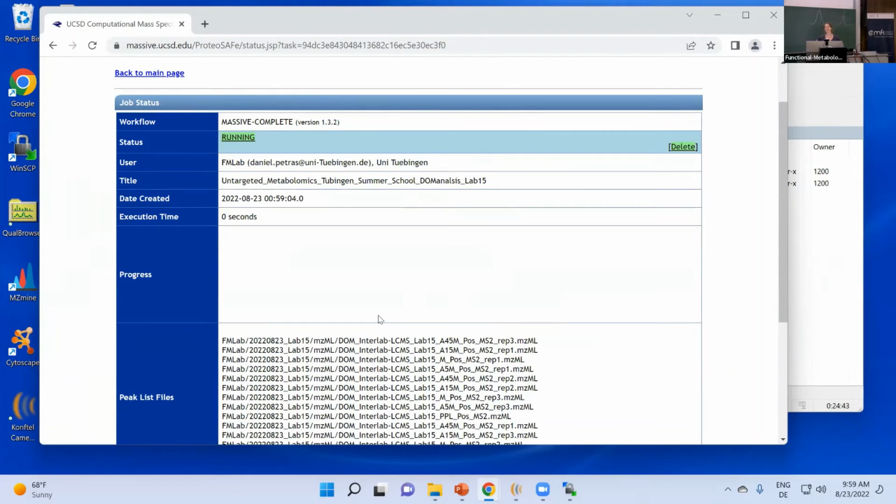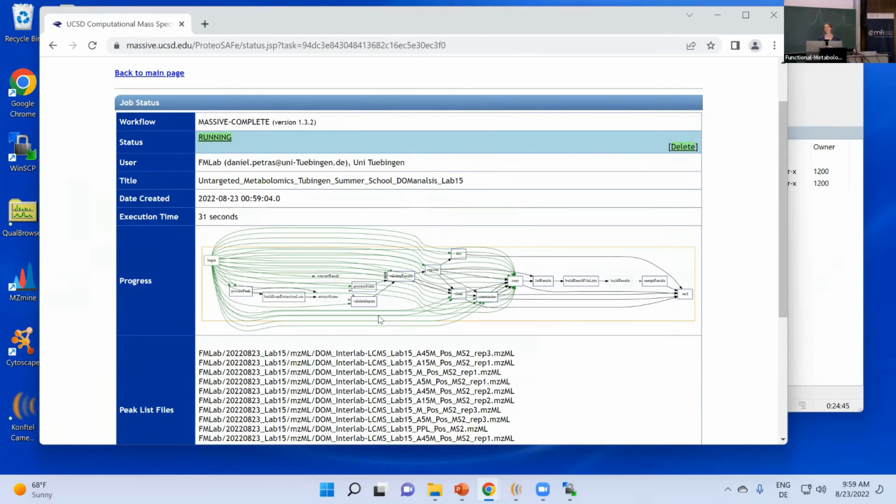Yeah, go ahead. So you run one data set, and then you rerun the data set, or you have more data, but it belongs to the same project. How would you do the data structure in a way that it all fits into one folder? Or do you use different folders to clean it up?